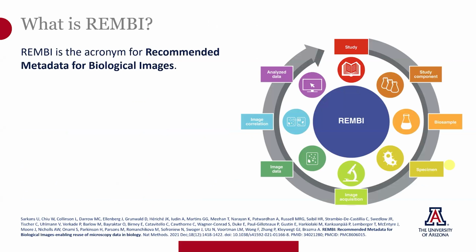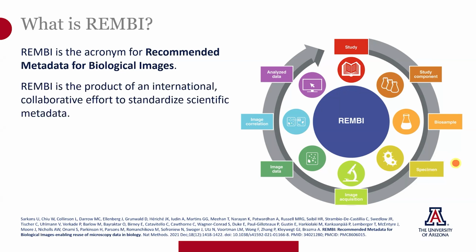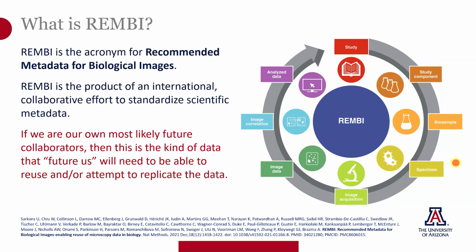I mentioned REMBI earlier. Again, that's recommended metadata for biological images. REMBI is a product of international collaborative effort to standardize scientific metadata. Consider that if we're our own most likely future collaborators, then this is the kind of data the future us will need to have to be able to reuse or even attempt to replicate the data.